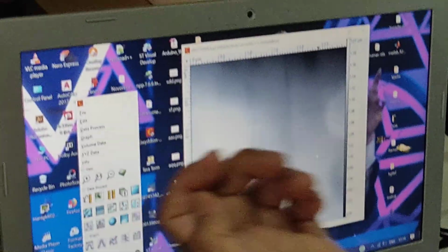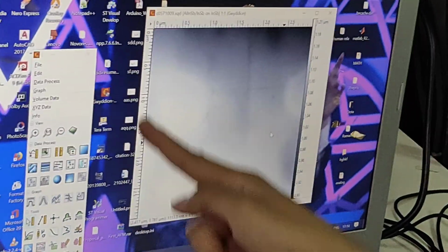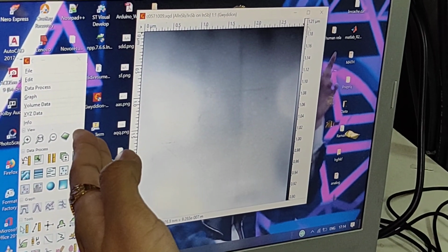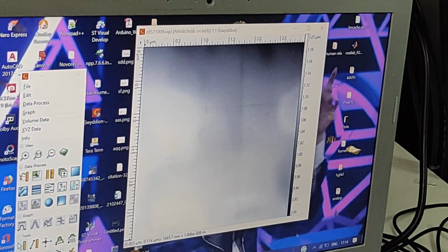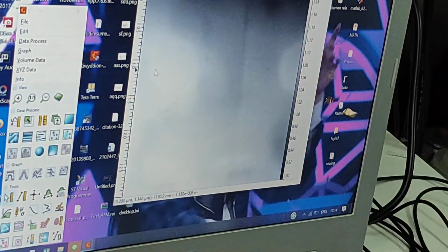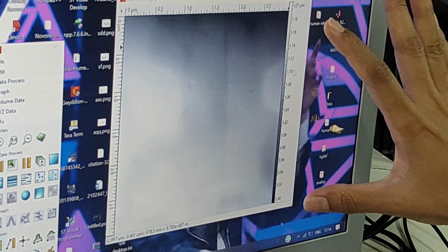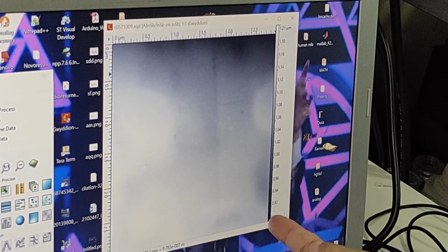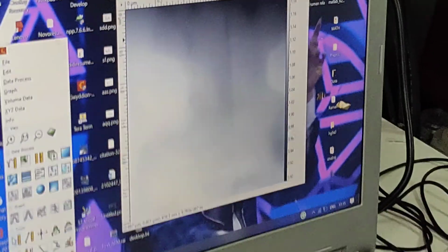Okay, and this ruler and this ruler show you your sample area, right? So this sample is 3 by 3 micrometer. And that is the color schema of your sample. The color schema should start from 0, right? So we can correct it.